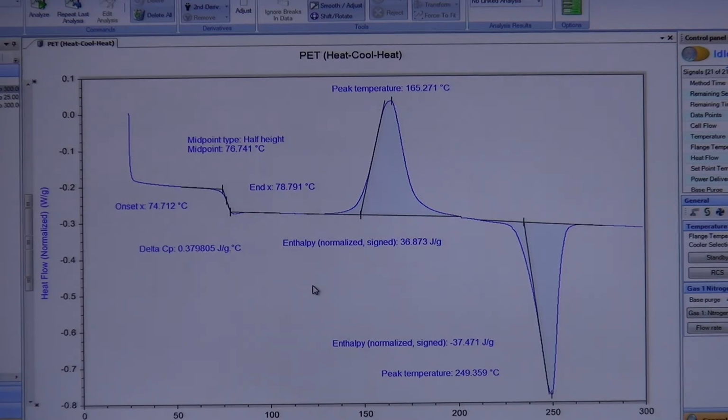That's basically the energy required to melt a full 100% crystalline sample of the same material. Now, from a physical perspective, that's actually impossible, but there are calculations and experiments that have been done to evaluate what that number is. For many, especially more common polymers, you can look them up. There are polymer handbooks and other guides, or just simply Google them, and you will find these numbers.